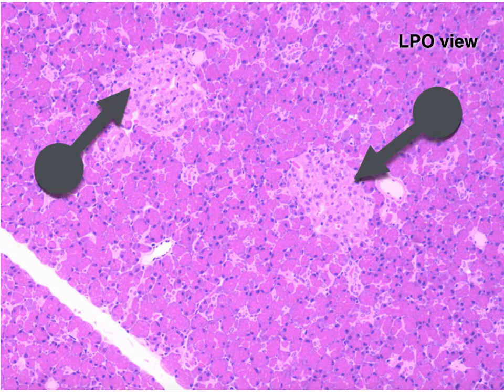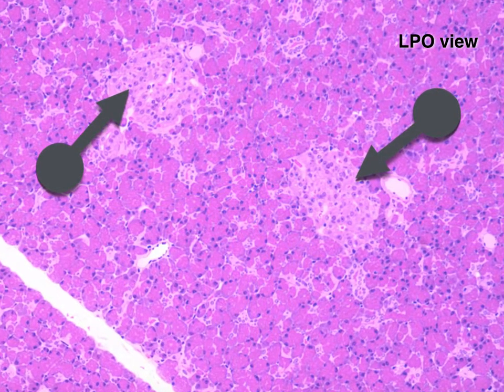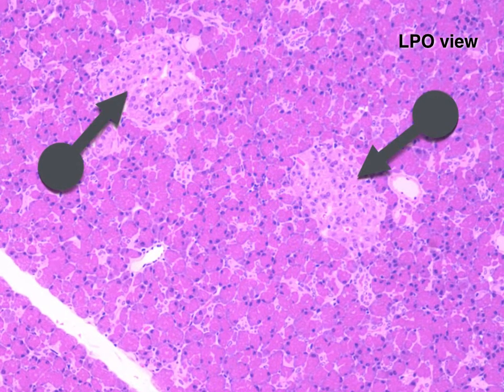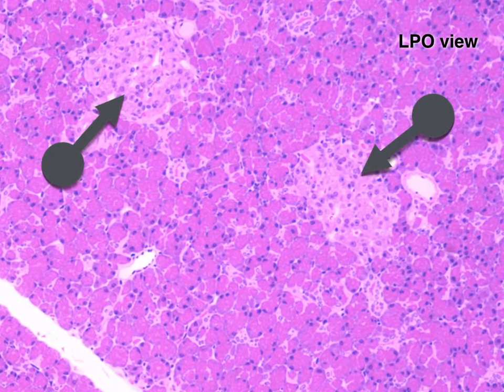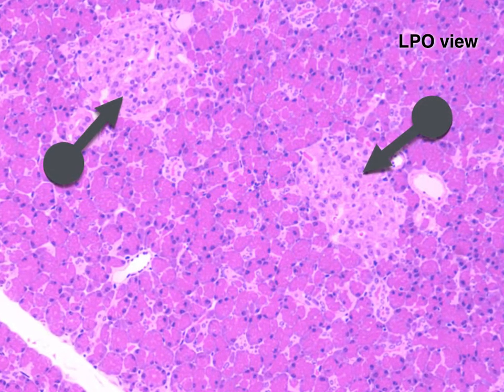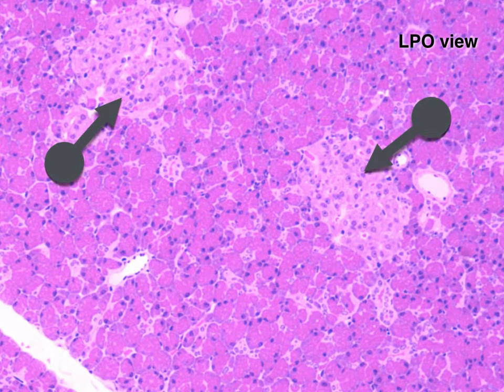The islets of Langerhans, as pointed by the two arrows, appear as distinct islands in a sea of pancreatic acinar cells. They constitute just a small percentage, 2%, of pancreatic tissue. The islets can be identified because of their distinct geometric cord pattern and high vascularity when compared to the acini. Within the islet are alpha, beta, and D cells. Several blood vessels are also visible near the islets.